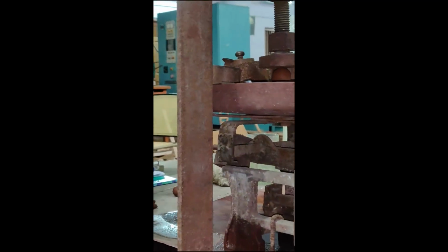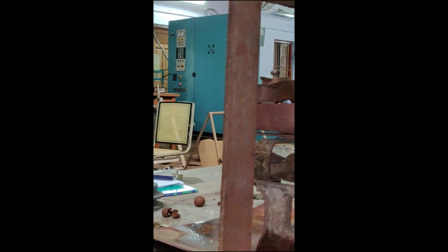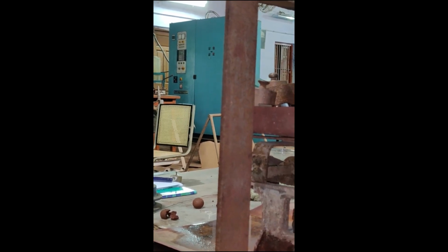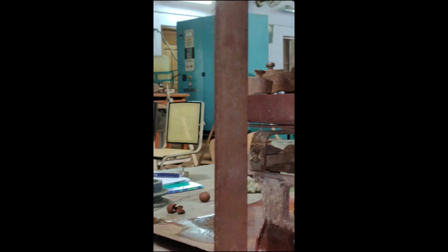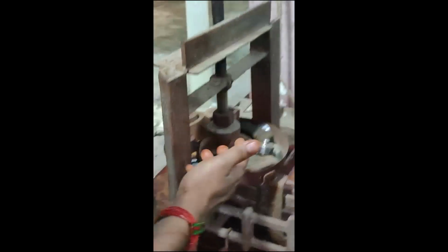So after balancing, touching the pellet. Now the pellet is between the plates.